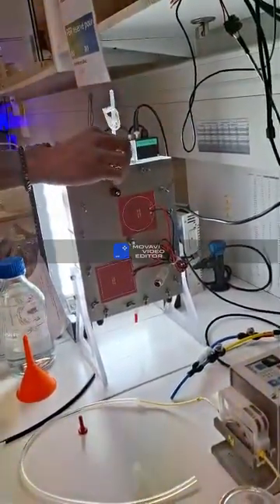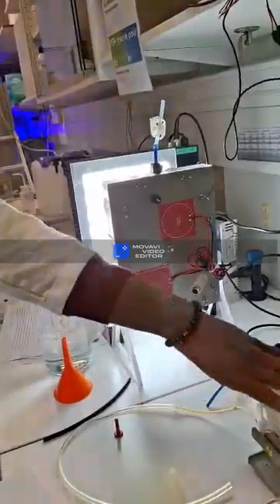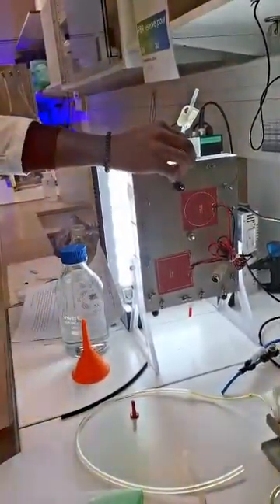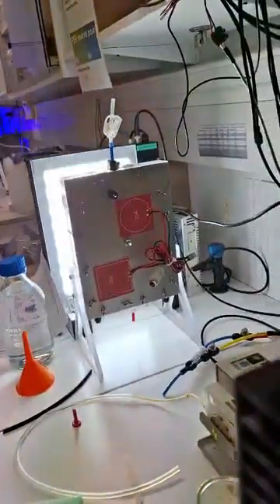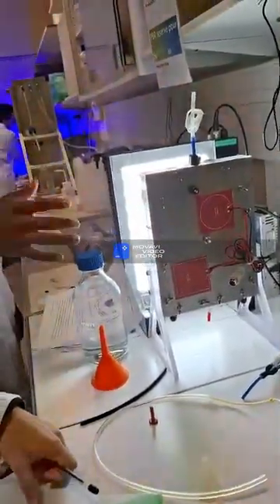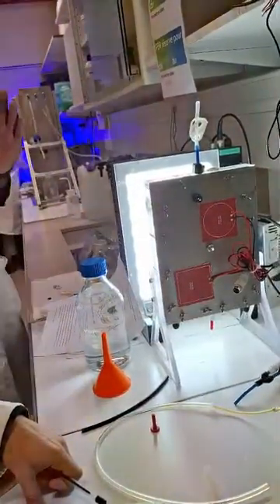So what is our flow rate now? It's not important what our flow rate is. The flow rate for the distribution of the culture medium? Yes, it's important, but it will be calibrated by the peristaltic pump. We have to calculate the flow rate as well. The air is not really important in this system, because we will have free entry for the air and the specific one for the carbonic gas. This is the most important.